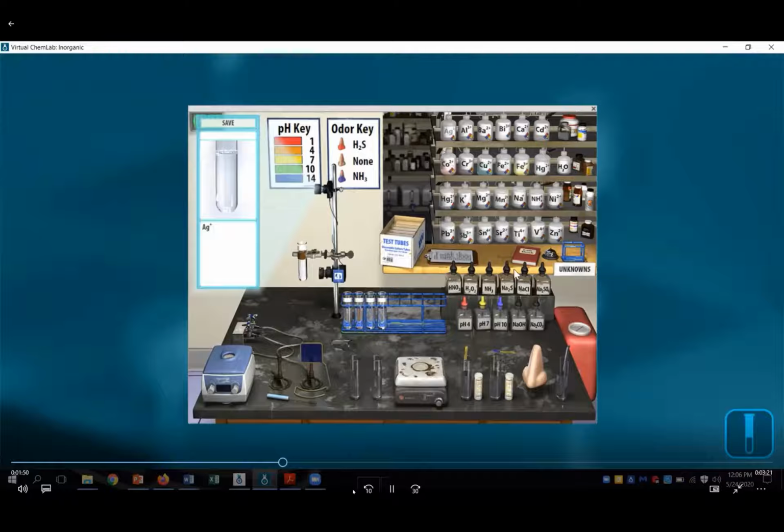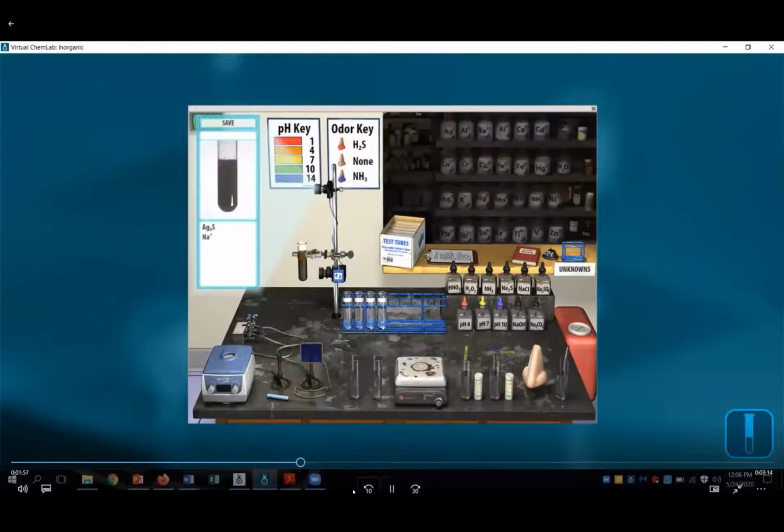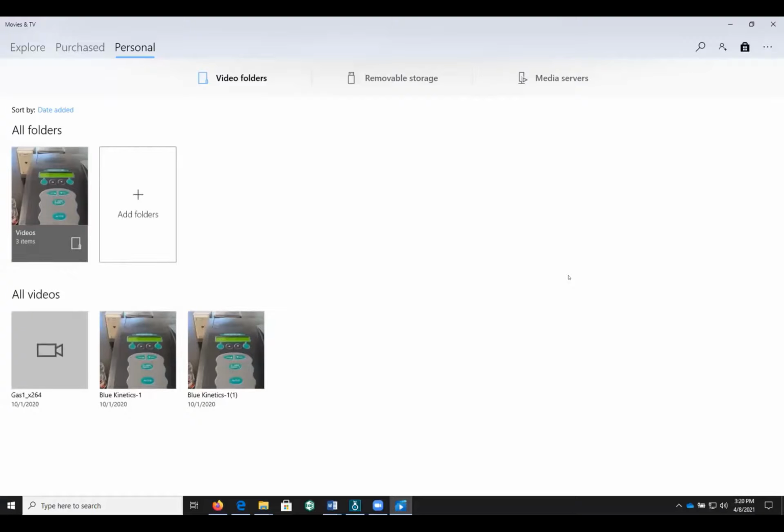You don't have to drag it. You simply click on it. You see my droppers over top of that. I'm going to click and watch what happens to the test tube up the upper left. As I added the Na2S, notice what happened, that I now created some nasty looking brownish, blackish solid. Okay, I don't want to take too much time doing that, but you get the idea.